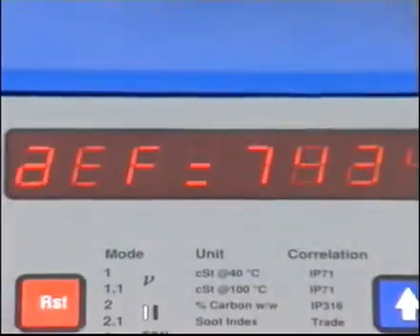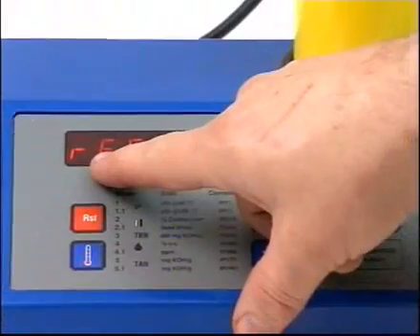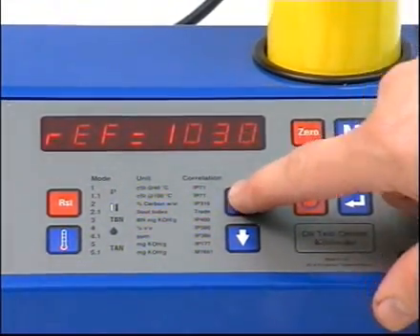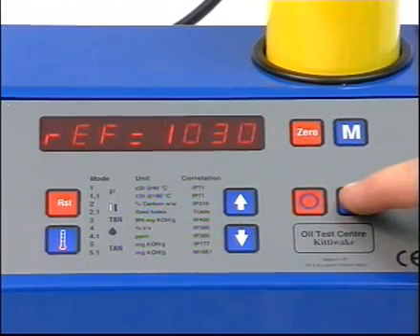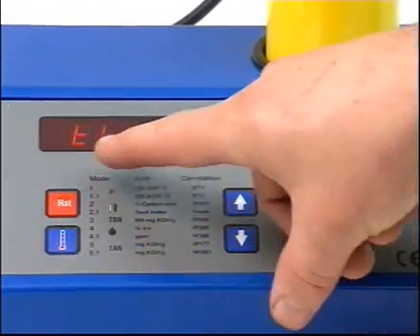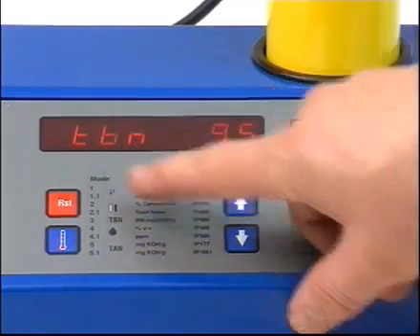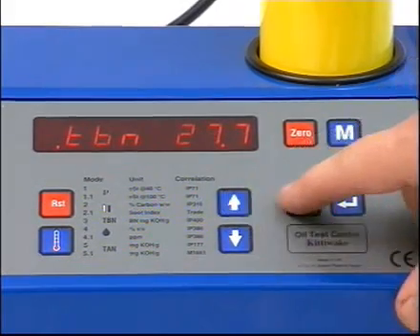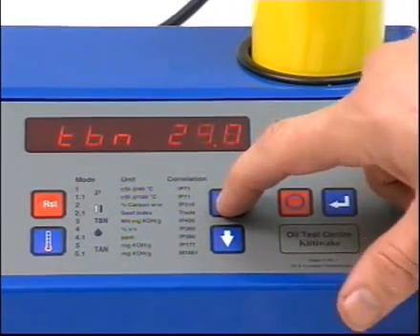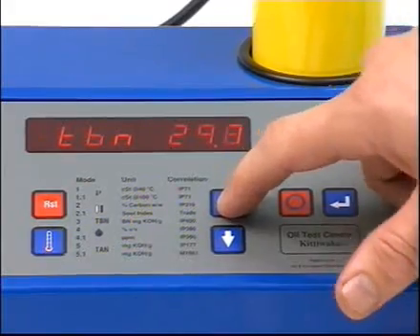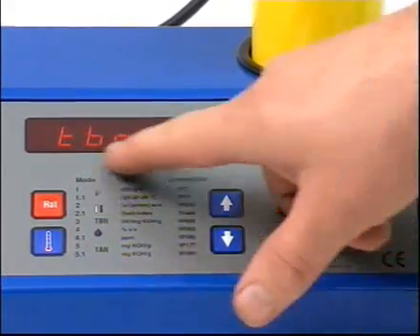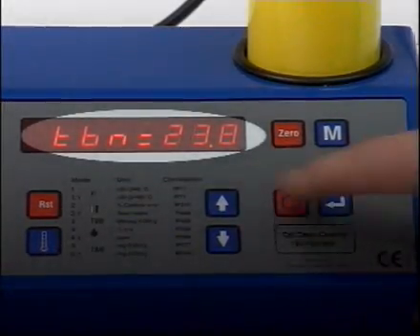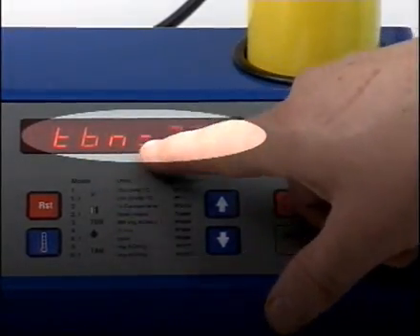Press enter and the unit will ask for the reference value that you have already logged. Use the speed and arrow keys to display this value and press enter. The unit will now ask for the new oil TBN. Again, use the speed and arrow keys to enter this, then press enter. The display will show the used oil TBN.